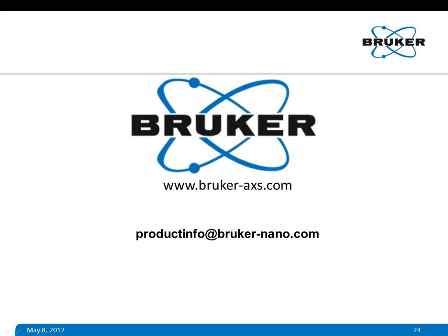Okay, to answer the first part of this question: the tribometer is equipped with Z encoders, which measure the position of the ball tip. So when there is material removal and wear taking place, you can track the Z movement and you know the depth. We can calculate the depth. We precisely know the length of the wear scar because we fixed it during the experiment. We just decide how much you want to go, 4 millimeter, 2 millimeter, or 1 millimeter, whatever. From that, you can have some kind of idea, but it is not accurate. So once you finish the experiment, you use the integrated profiler, which can profile the surface and measure the volume.